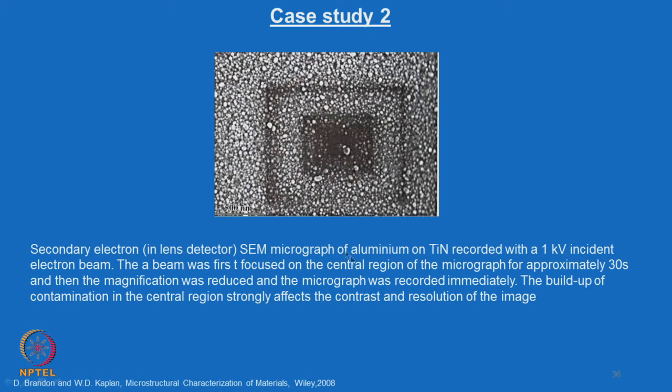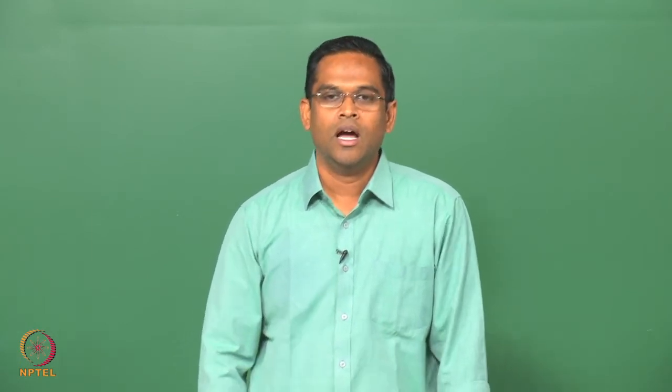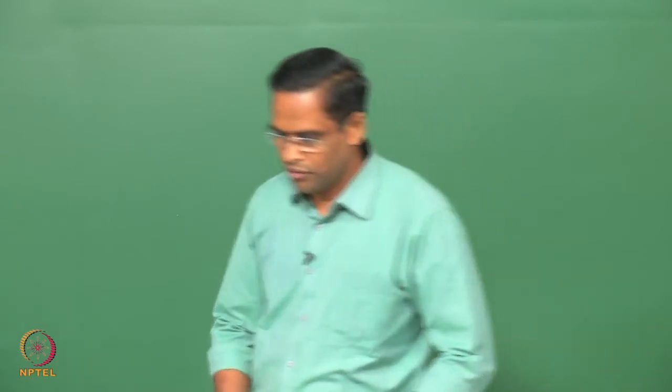So, if you expose this electron beam to a beam-sensitive specimen like this for more time, then the buildup of contamination is inevitable, and that is why it is very important that you do the recording very fast. So, you have to take that precaution, and then why this contamination is forming and the reason for the sample to be clean, that is something you have to clearly keep in mind, and in order to do that, let me write some of the few important points.